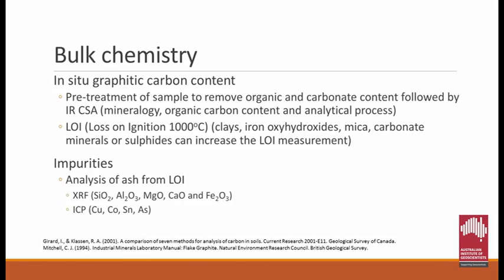And there are two major methods to estimate graphitic carbon content. The main one is using a carbon sulfur analyzer.